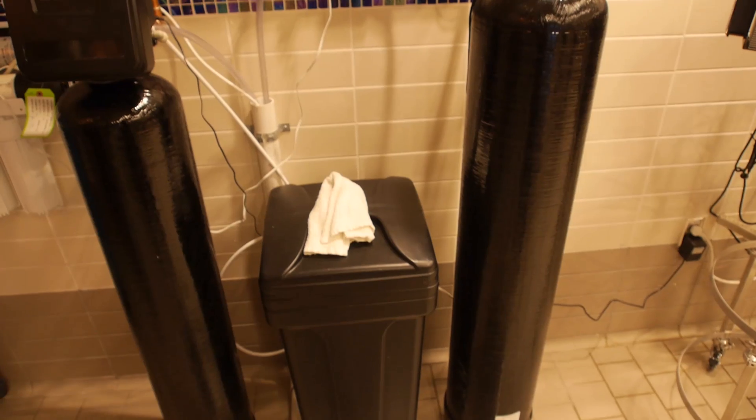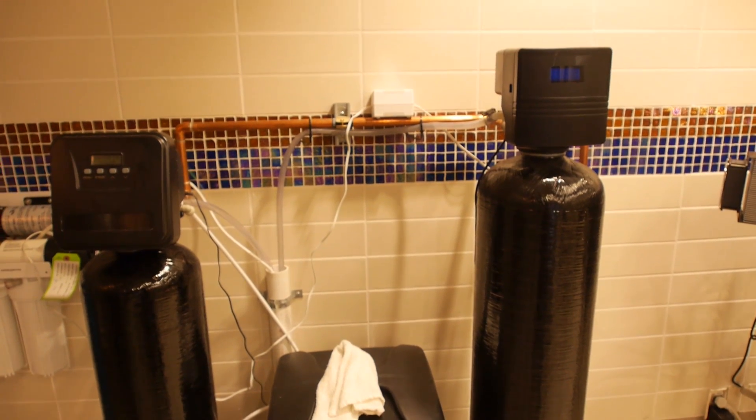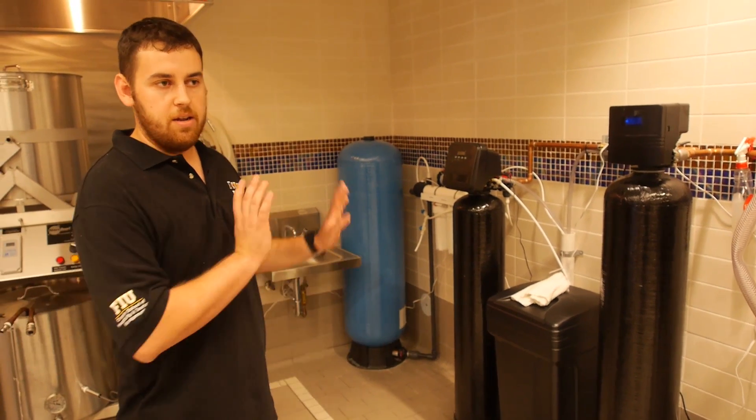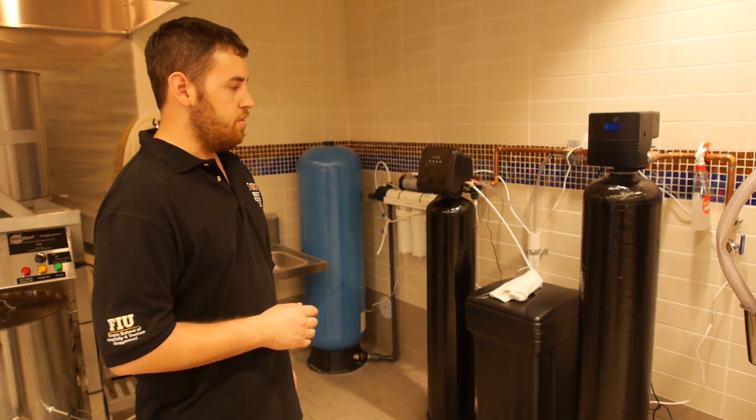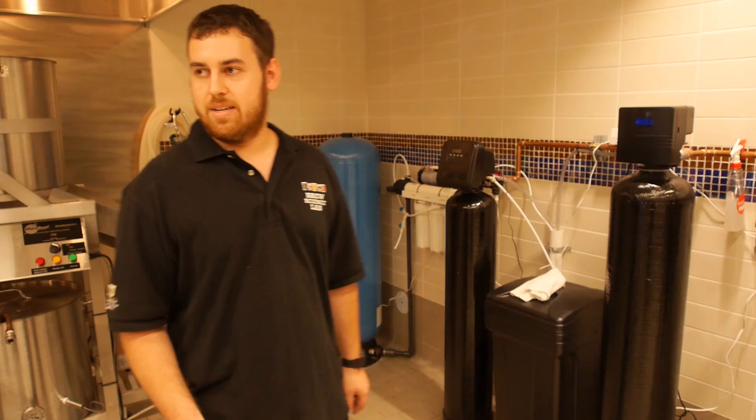Here we have a reverse osmosis system. Basically we can strip the water to whatever we'd like, and we need it for other things in the lab. So we're going to have fresh RO water, which is another great aspect of this lab.